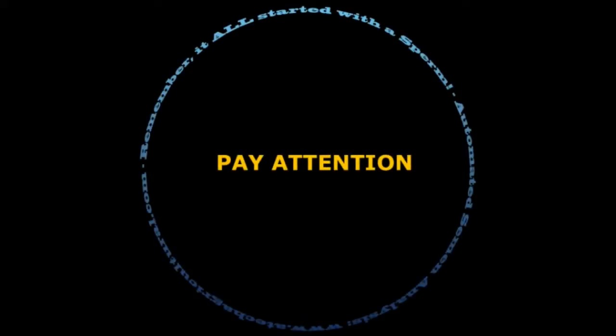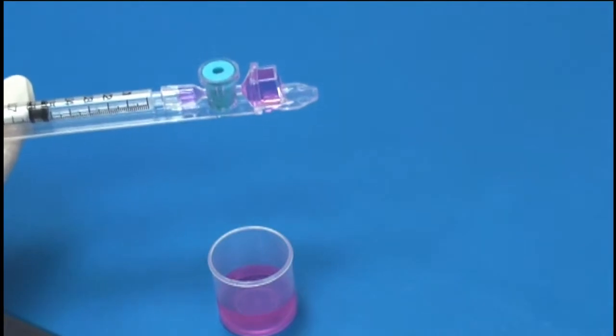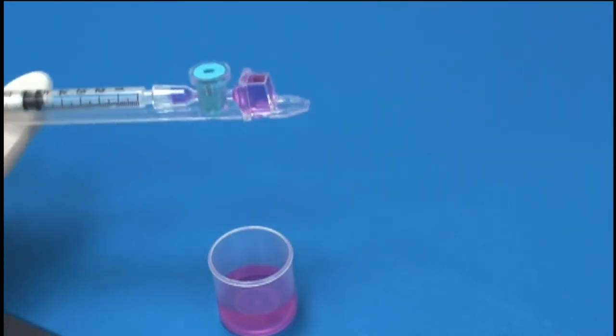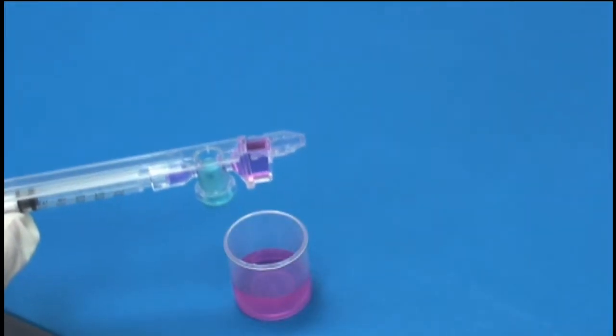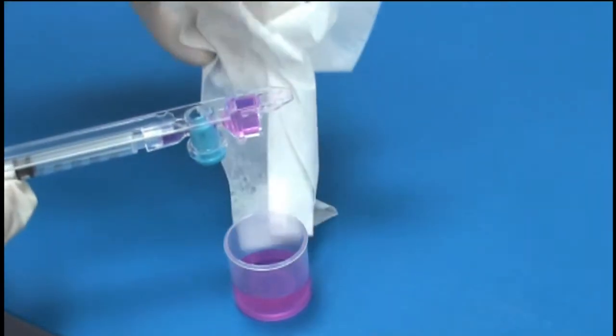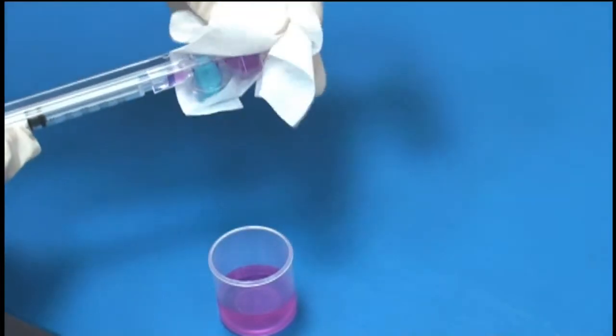As you learn to load the testing capillary, you must pay close attention to the following. There cannot be any bubbles present in the large square concentration chamber or the thin front motility chamber. When you wipe the capillary tip clean, wipe away from the opening to avoid wicking the sample out of the testing chamber.